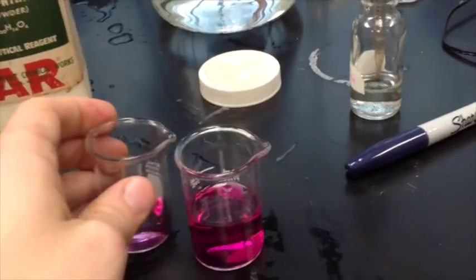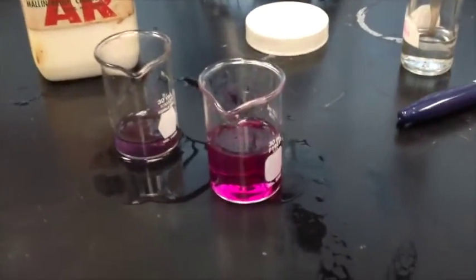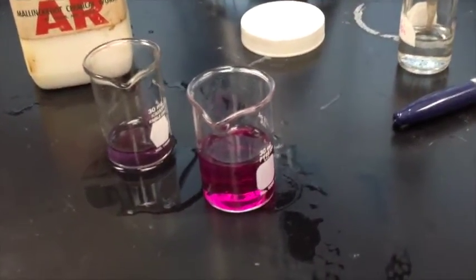Just like that. So this indicator can tell us a little bit what's going on in our reaction vessel here without having any instruments in there. And that's going to be how we judge a rough titration.